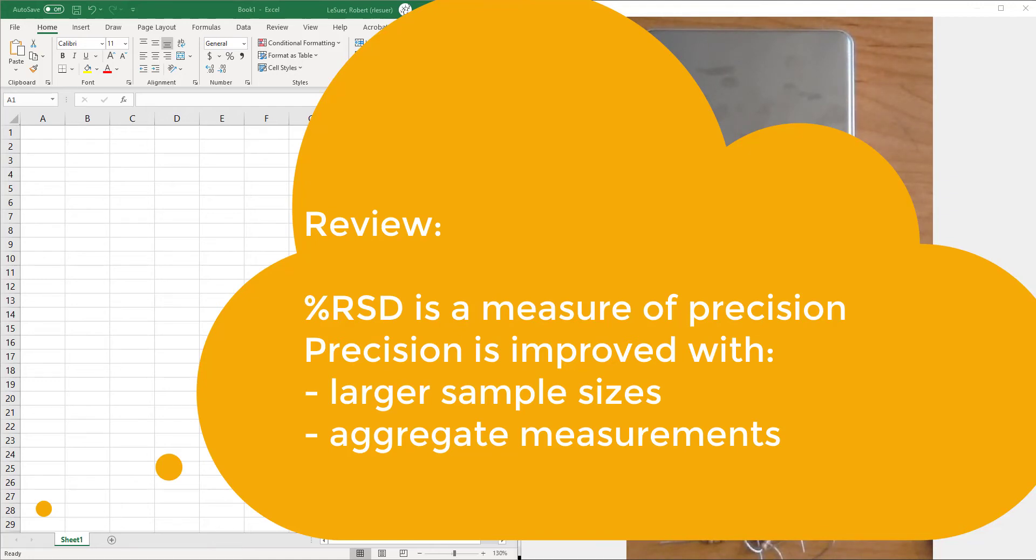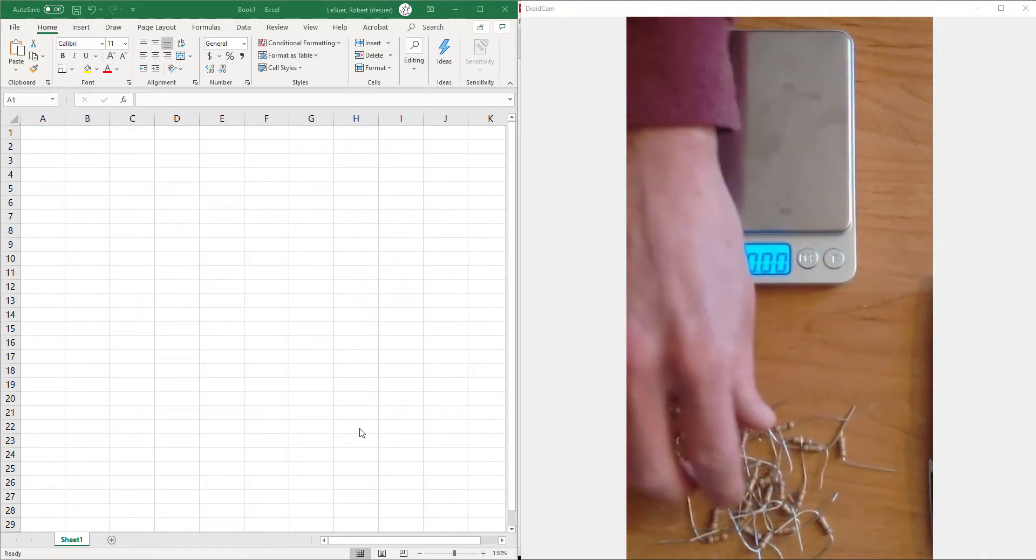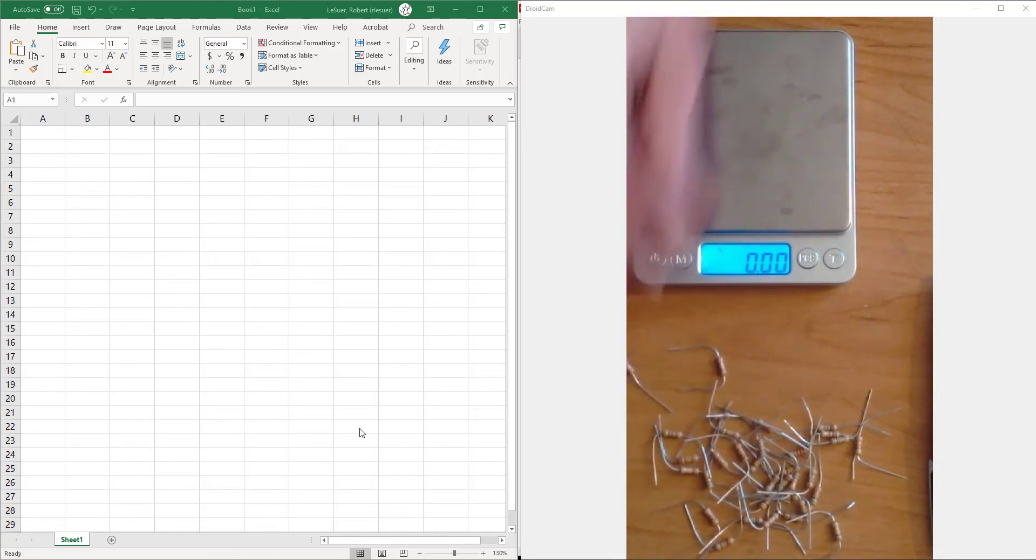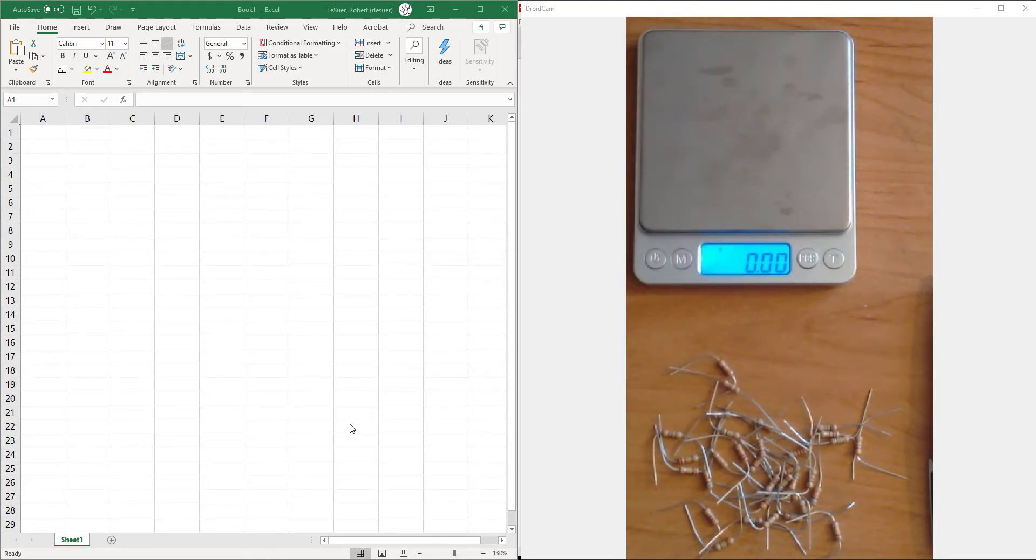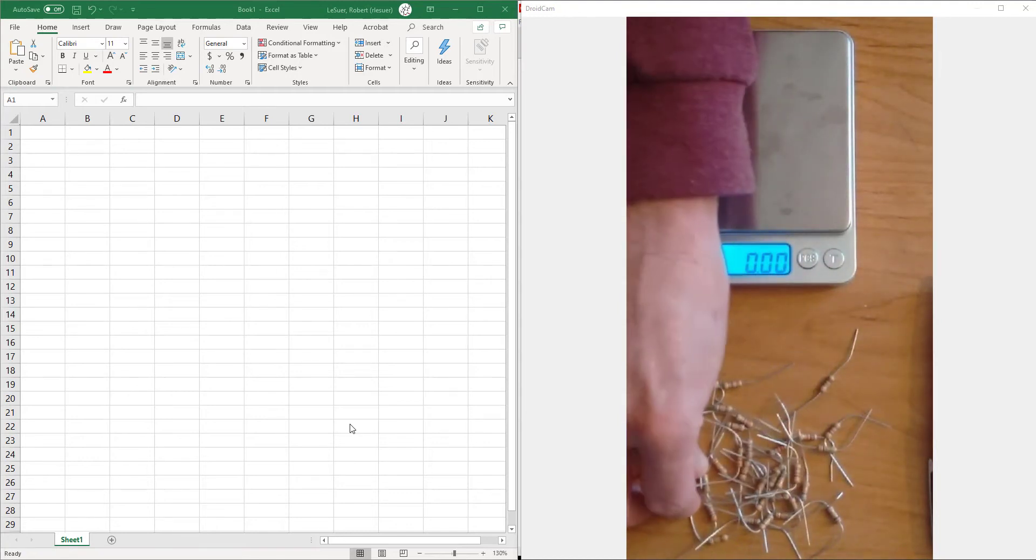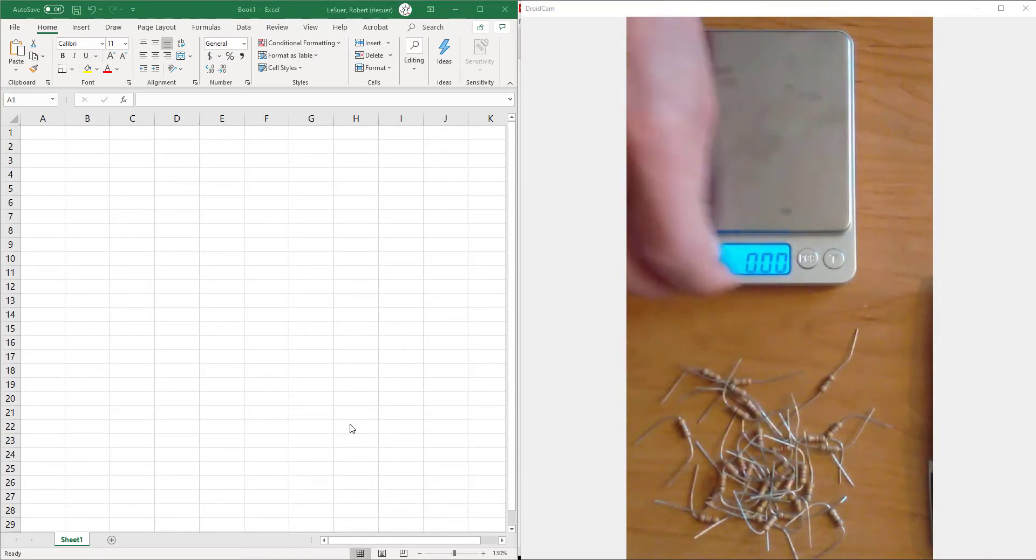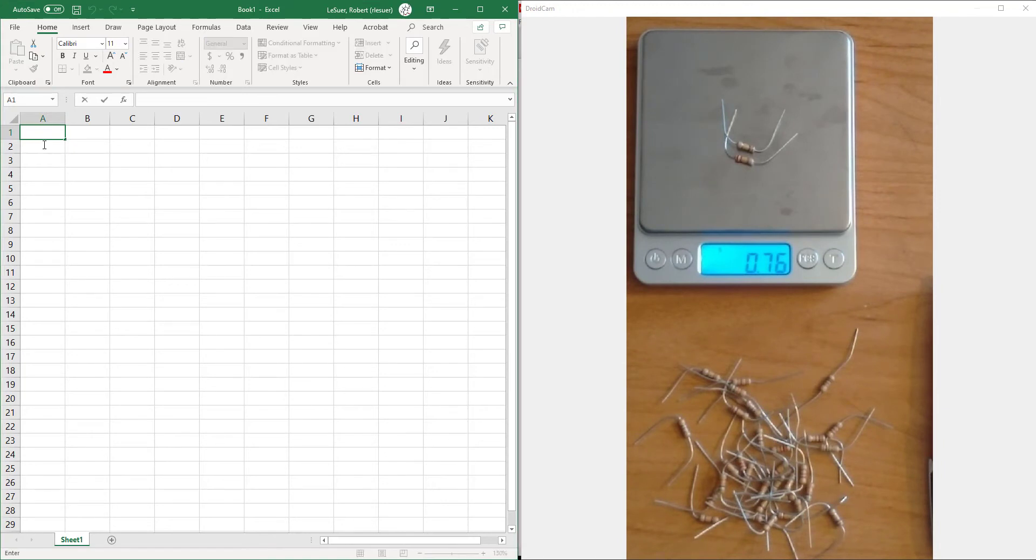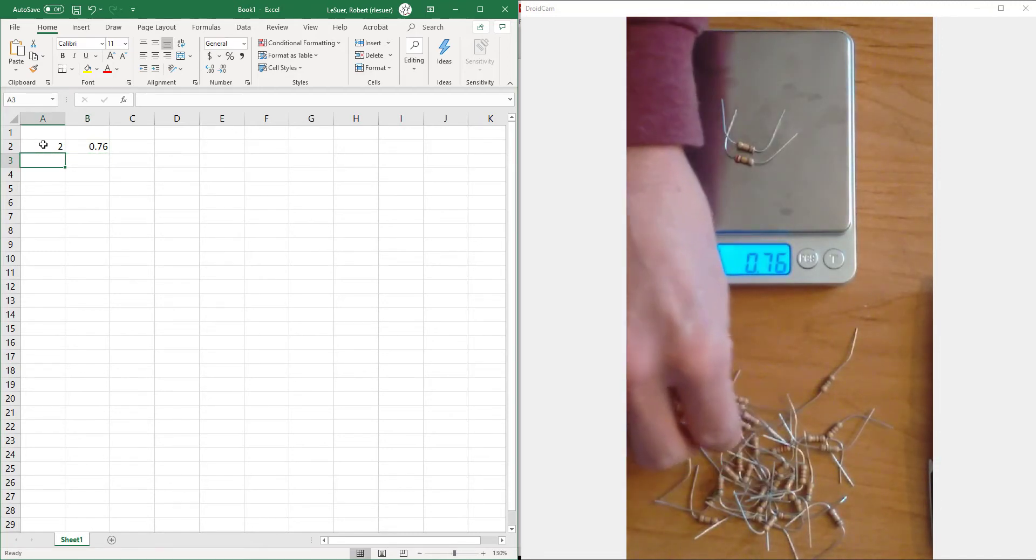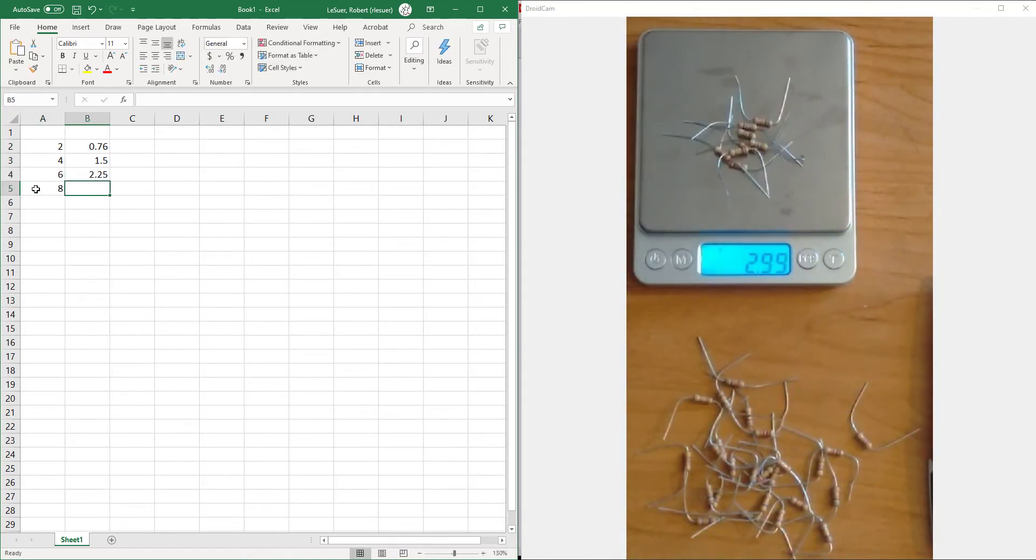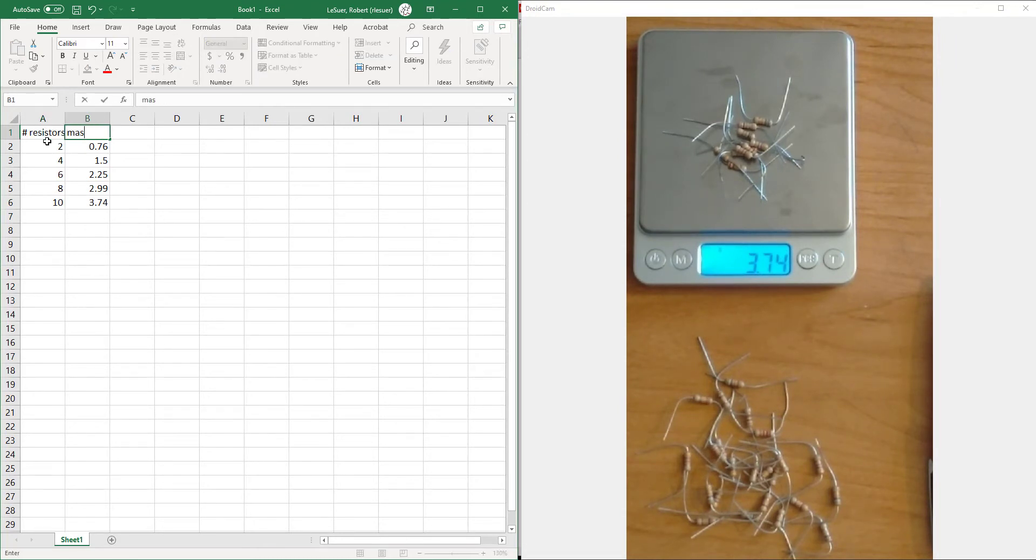What we're going to do is create a relationship between the number of resistors that we've got with the weight or the mass of the resistors. We would expect the mass to increase as the number of resistors increases. I'll measure the mass of two resistors. I get 0.76 and I'm going to continue this up to 10 resistors. So we've got the number of resistors in column A and the mass in grams in column B.